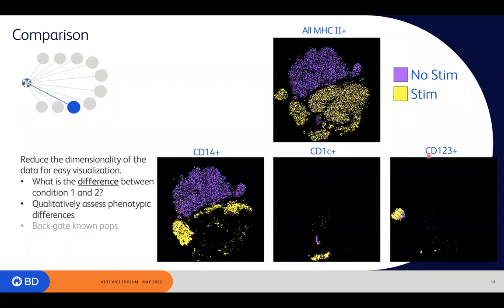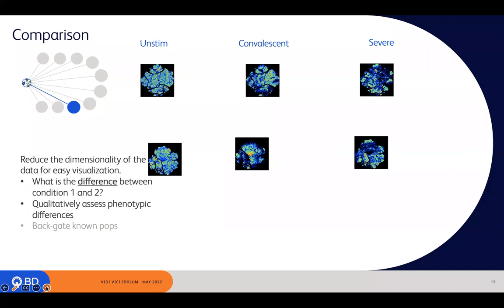Okay, in the case of the plasmacytoid dendritic cells, very few cells exist in a non-stimulated state. Once you dump the agonist on there, you get more. But you can compare essentially compartment to compartment or condition to condition, however you want to set it up.